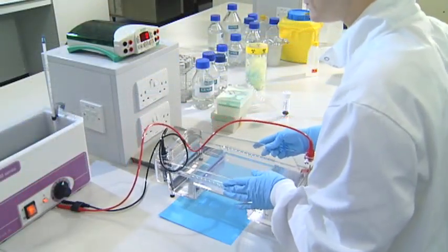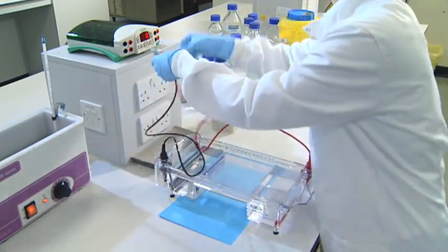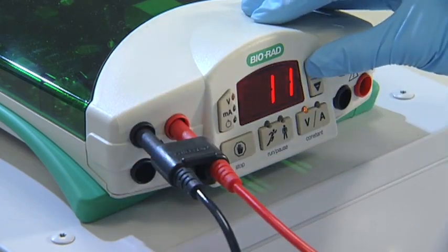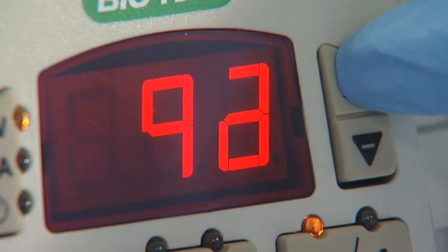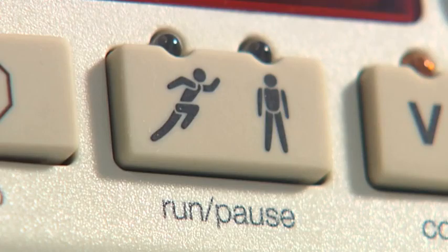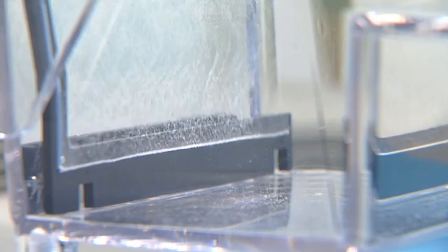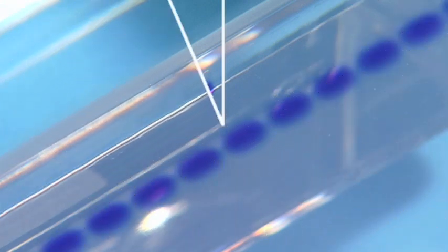Close the lid of the gel tank and attach the leads both at the tank and the power pack the correct way round. Set the appropriate constant voltage. This will create an electrical current through the buffer and the gel, starting the process of size separation of the nucleic acid fragments. You should be able to see bubbles rising from the negative electrode. After a few minutes, the dye, and therefore the nucleic acid fragments, can be seen to migrate from the wells into the gel, showing that the process is working.